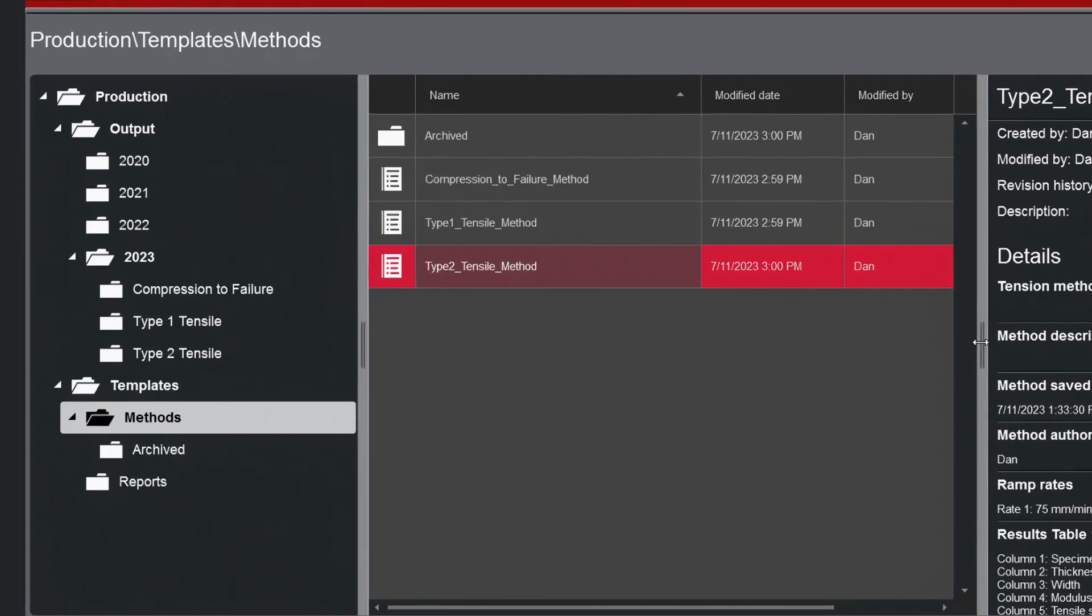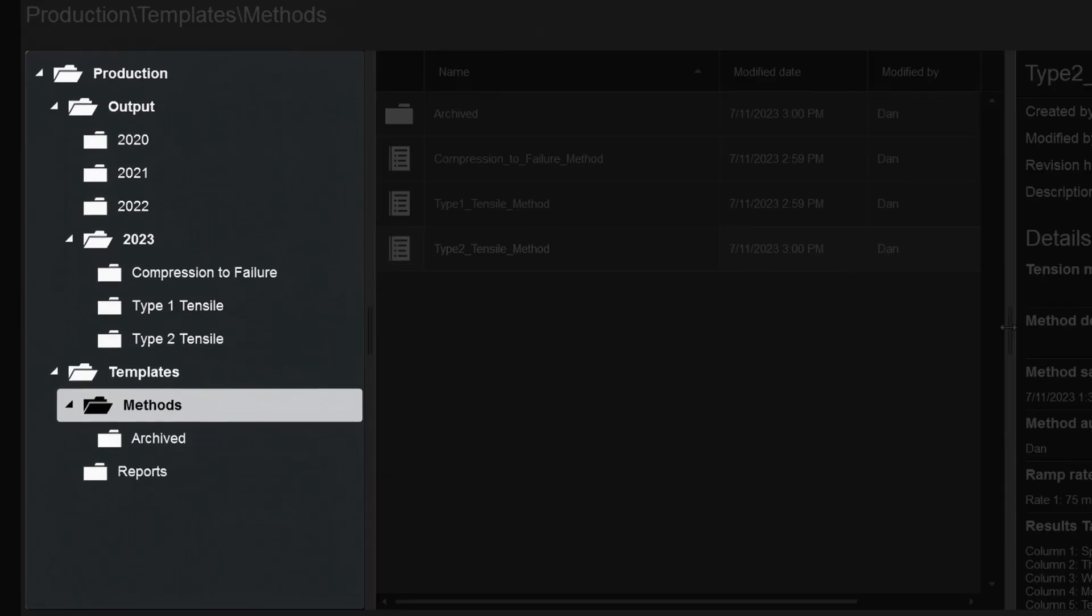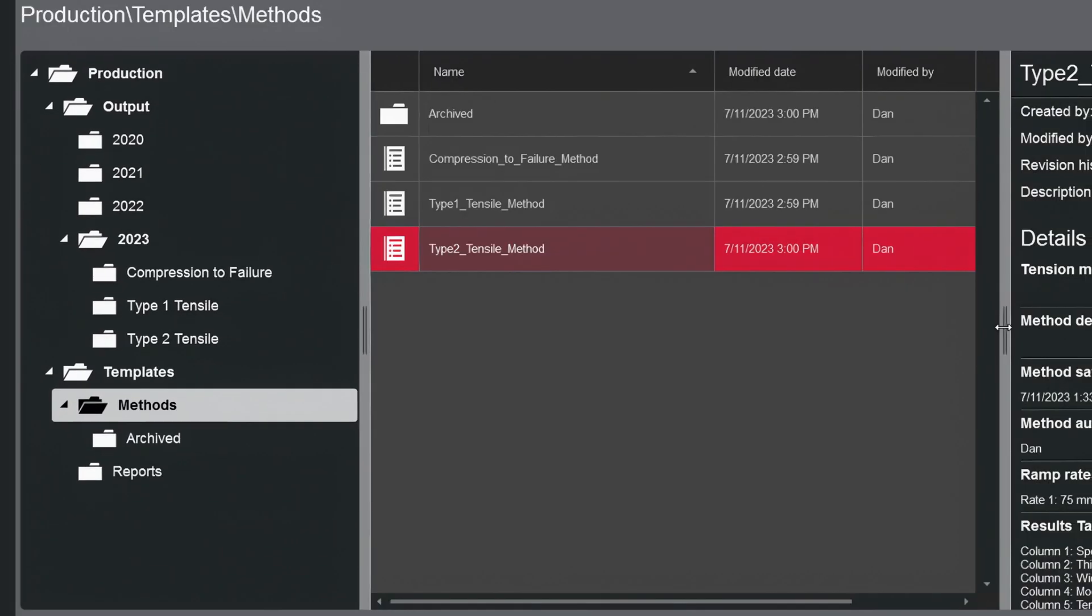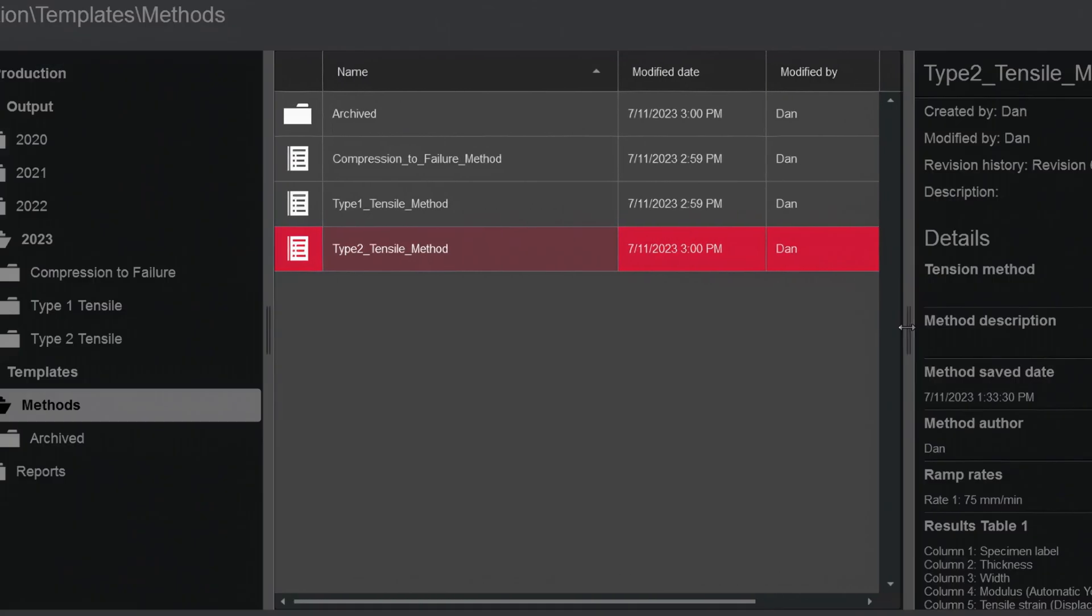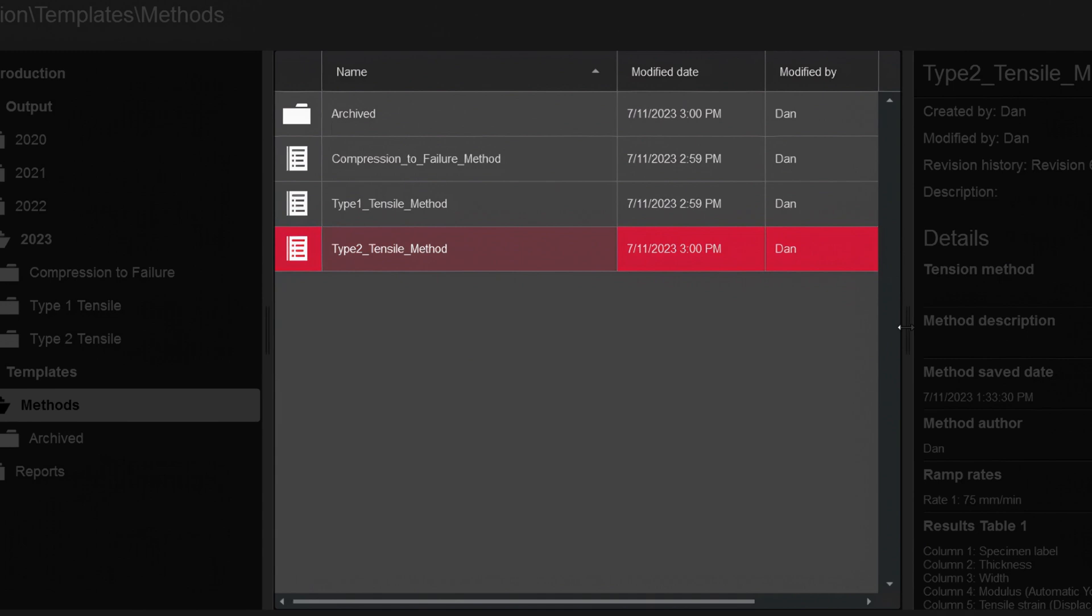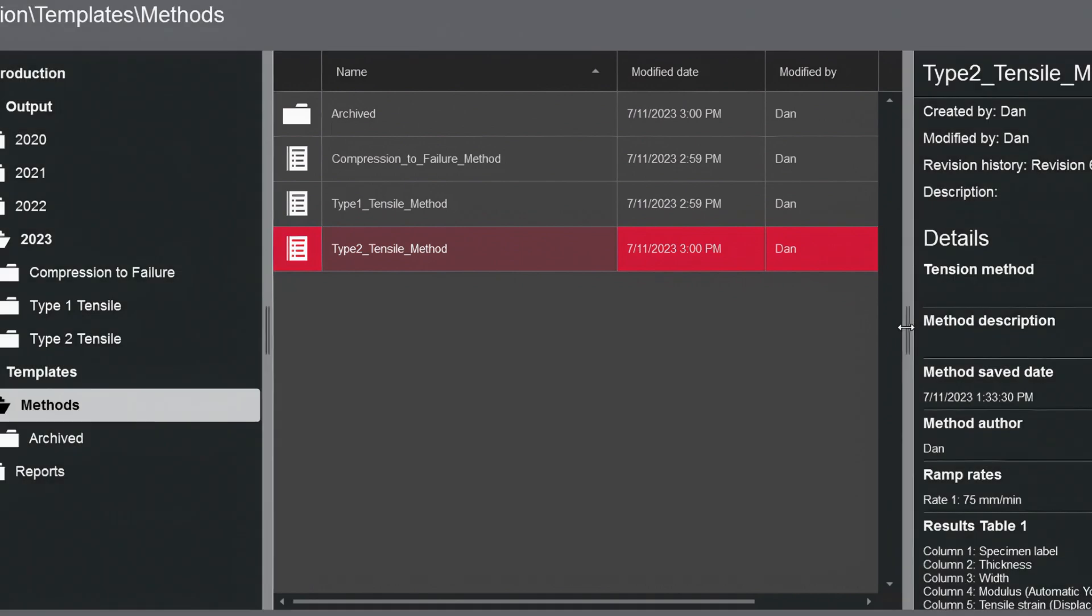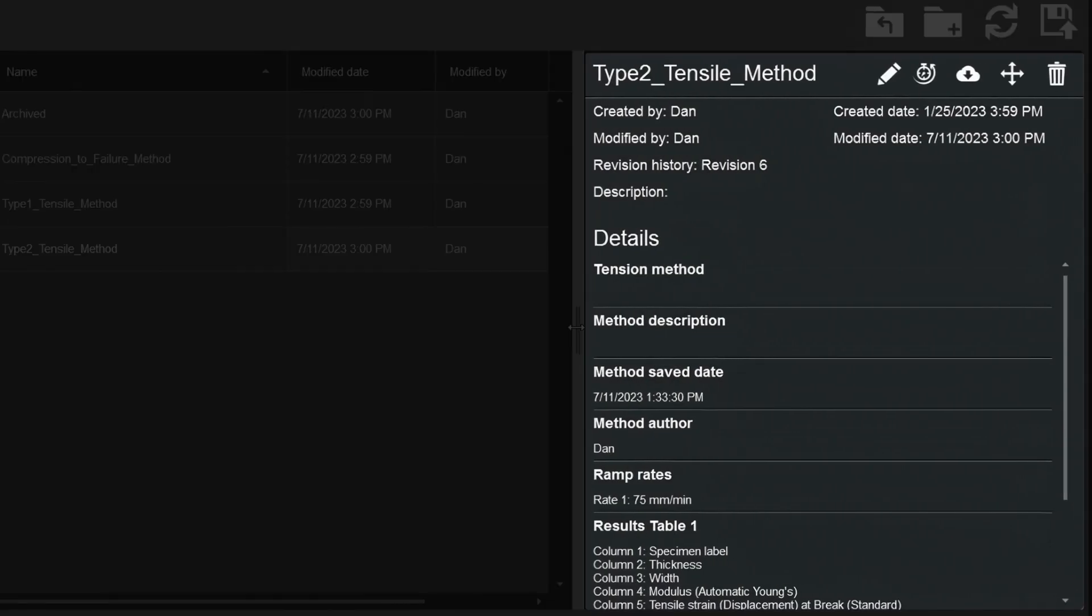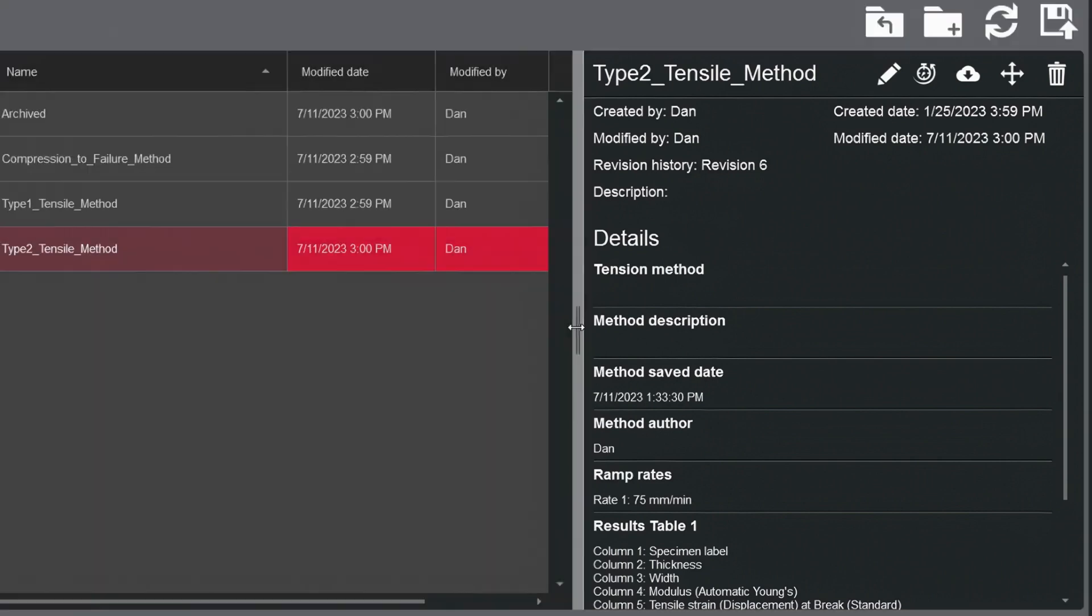Your custom folder structure is displayed in the pane on the left. The selected folder and its contents are displayed in the middle, and the details of a selected file are displayed on the right.